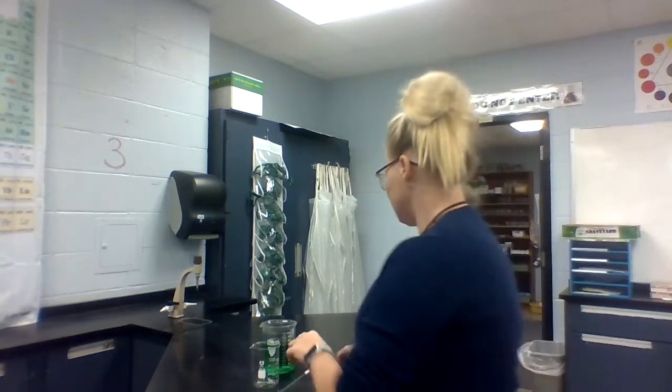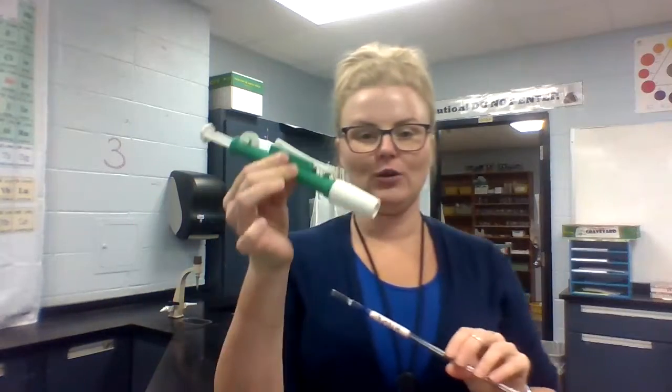In this video I am going to show you how to properly use a pipette. To start with, you have the pipette and you have the pump.